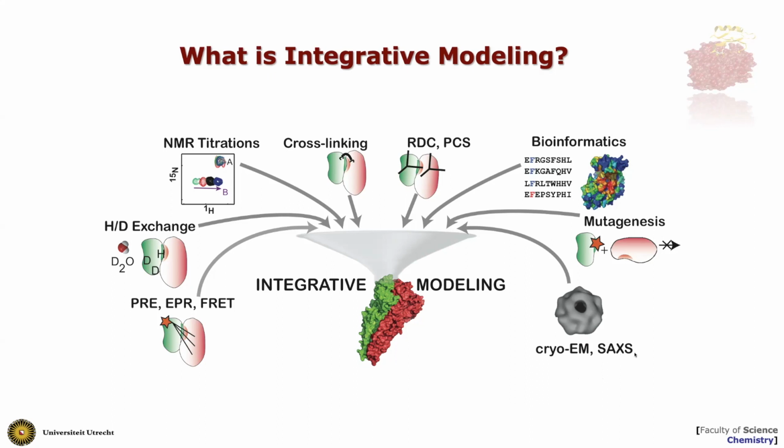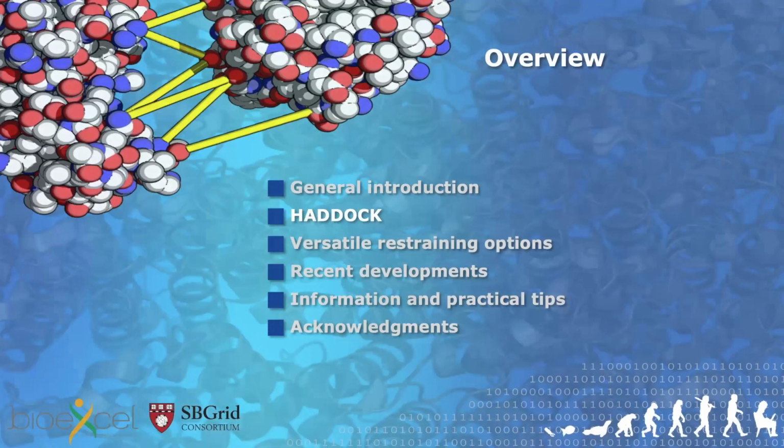So cryo-EM, small angle scattering, neutron or X-ray scattering, cryo-EM if you don't reach the atomistic resolution, and there are still plenty of cases. Cryo-electron tomography will probably still have a hard time getting to atomistic resolution where you could build your complexes from scratch. So there, if the resolution is more limited, say medium, 5 Å and higher up, you might need to resort to docking methods, modeling methods to build the complex into those shapes. And this is again information which in principle you can combine into some kind of integrative modeling software to get the answer that you are looking for. So this was the general introduction in terms of where we are sitting in terms of field.